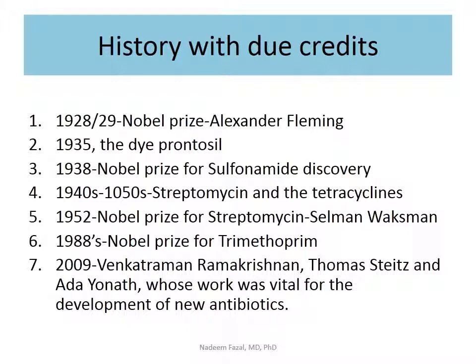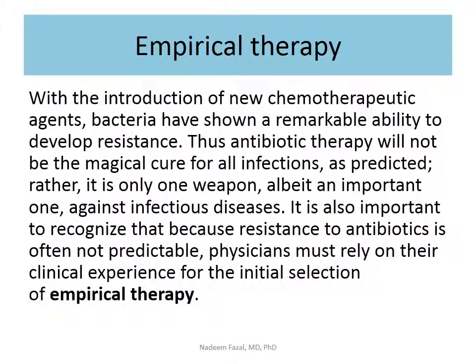Okay? Now, the question is why do we need to do Gram staining? If you were to work in any place, even physicians, pharmacists, dentists, any healthcare professional, you see a person who is infected and you see a wound, you see some specimen, you immediately want to find out what kind of bacteria that is, because you want to start an empirical therapy. You want to start antibiotics, and you don't want to start broad spectrum antibiotics. You want to make at least this demarcation, gram positive versus gram negative, and look at them under the microscope. So you want to start what we call empirical therapy.